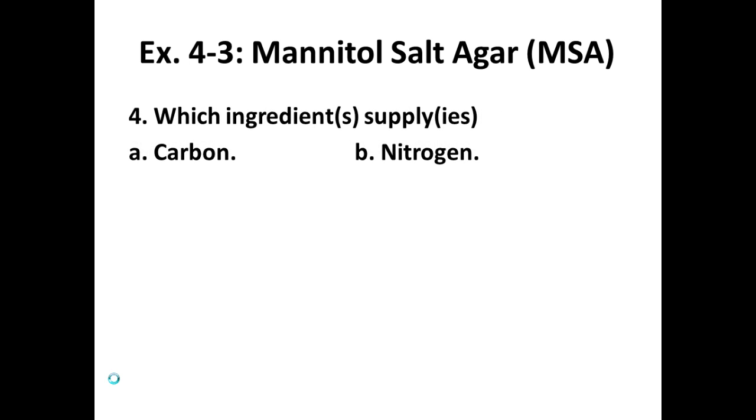So what's in this media? For nitrogen and carbon sources, which we know organisms have to have. With the citrate test, we had to give them a carbon and a nitrogen, or they wouldn't grow. We were just really evil, and only gave them one choice, citrate or ammonia. That was it. This media contains beef extract, which is both a carbon and a nitrogen source, because this is basically animal cells.